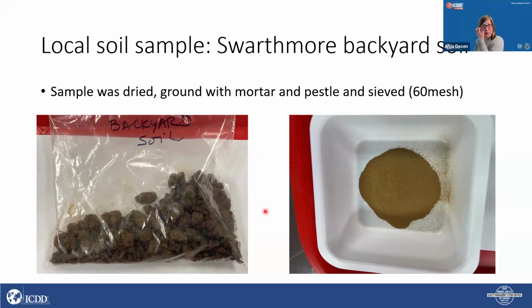So that's something that you can do, a visual determination, even before you do the X-ray diffraction analysis. These are micas. We live in the Philadelphia area. Rocks are metamorphic here. We're in the metamorphic core actually, and there is a lot of mica. You know that by just seeing all of these shiny rocks around, so we can expect to find this in our sample.